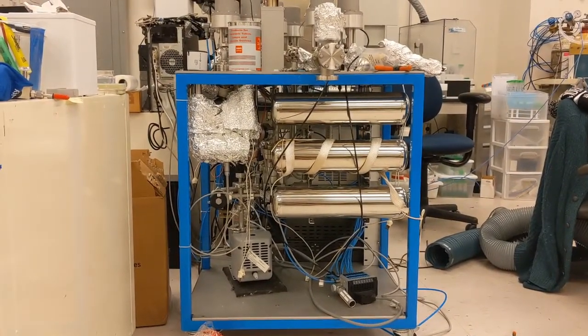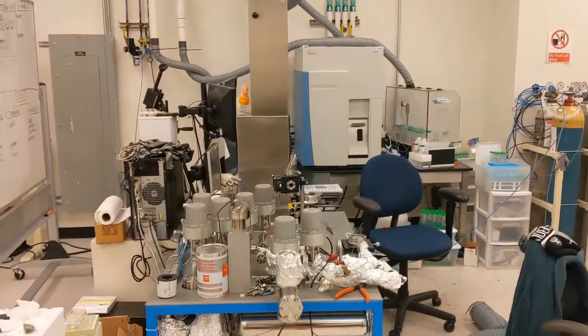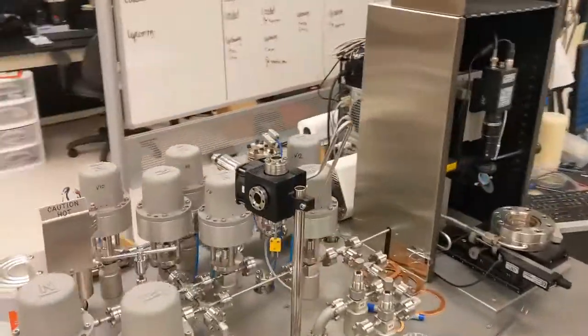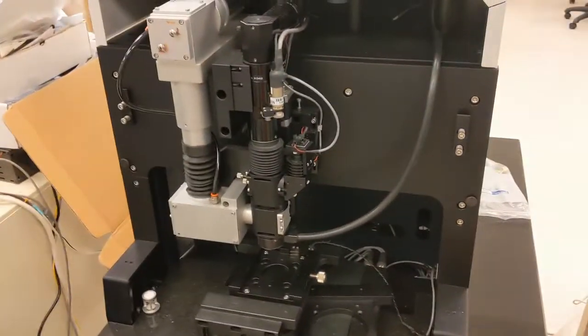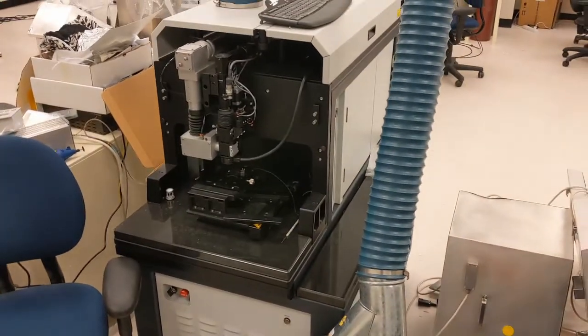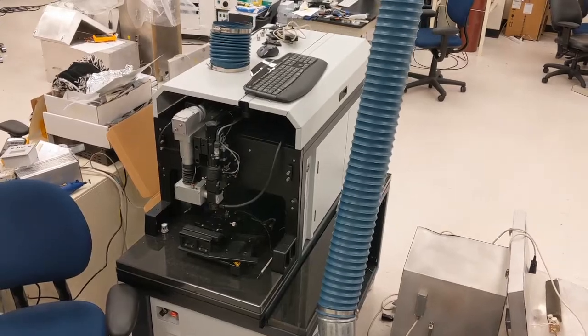We then measure the helium isotopes using this machine. The other option is we can put the crystals, again helium-bearing crystals, into a mount, and we can do laser ablation work on them, and using an ultraviolet laser we can ablate small pits, and we measure the helium that comes out of that pit.